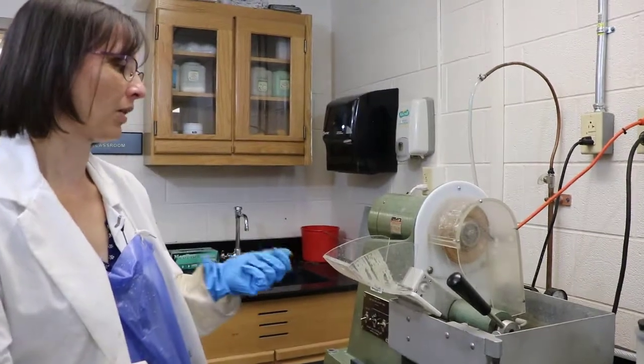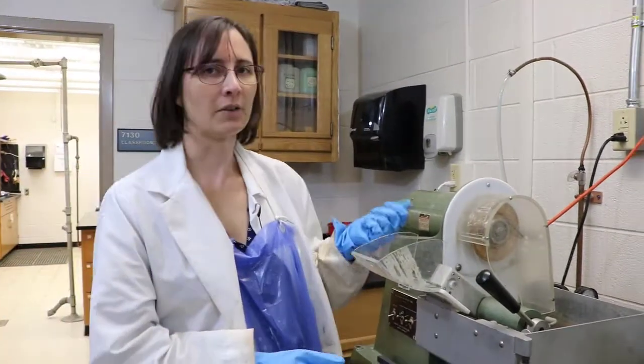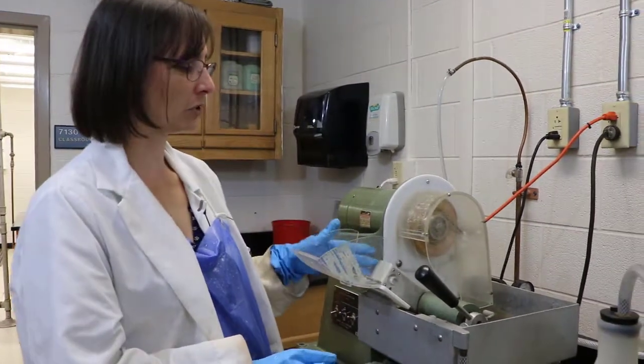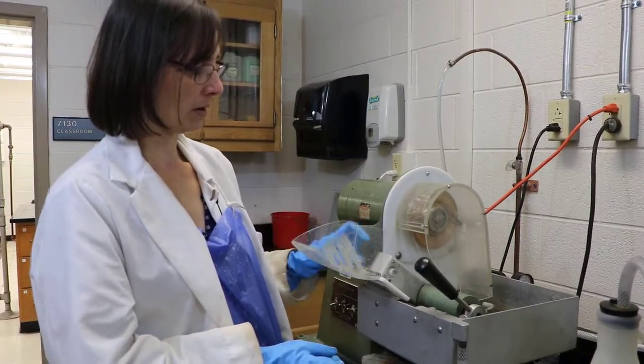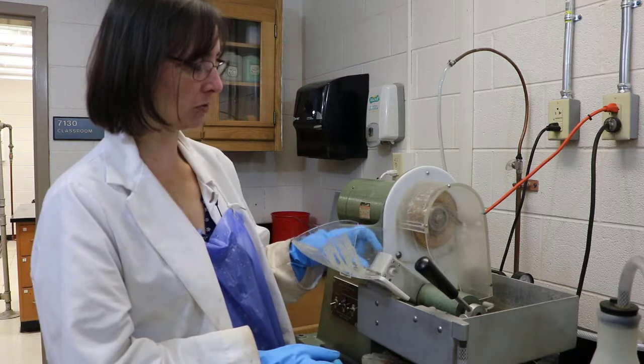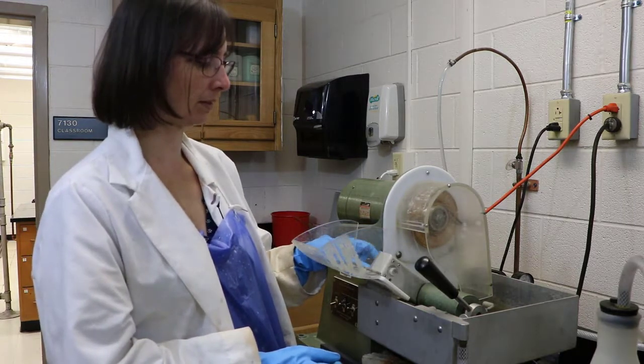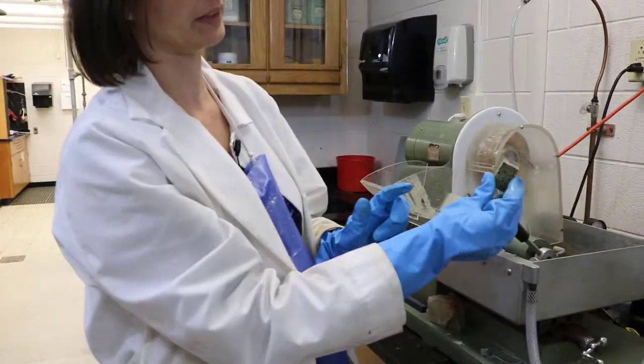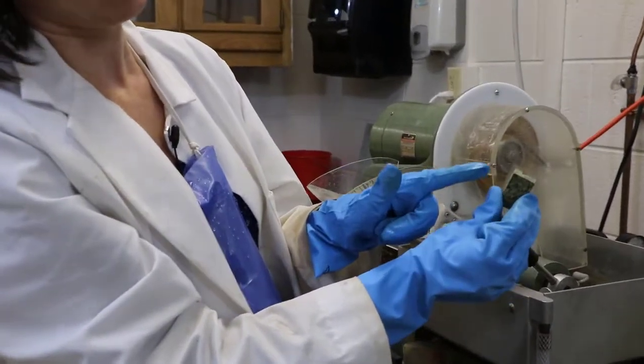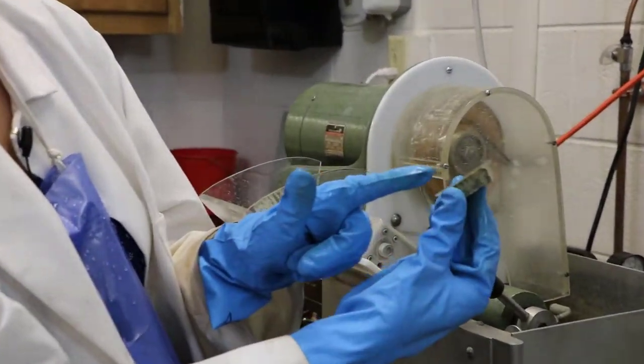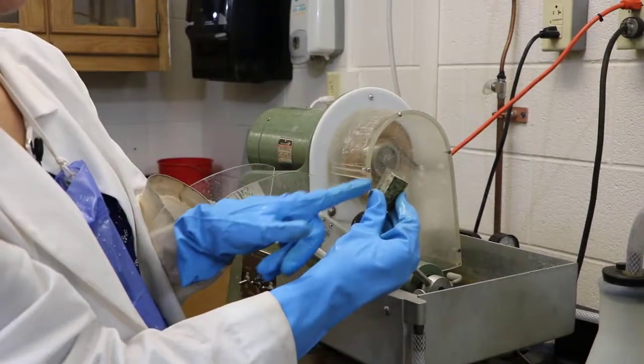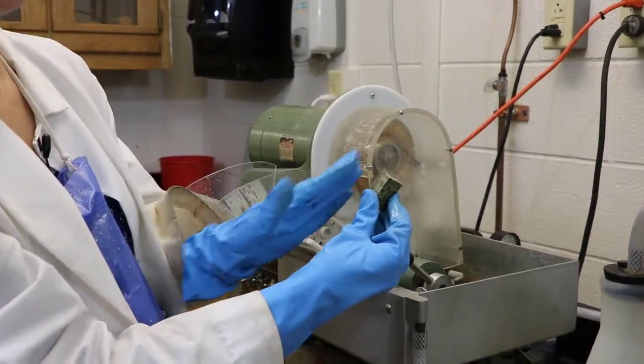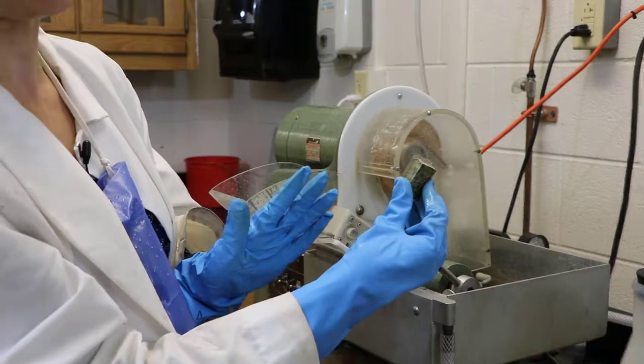In this video I want to show you the parts of the thin section cutoff saw. This saw is used to cut the rock chip that you use to make the thin section with. In this case you will have already glued your rock to the slide like this. And this instrument is used to cut off most of this rock chip so that you have a very thin slice of rock left over.